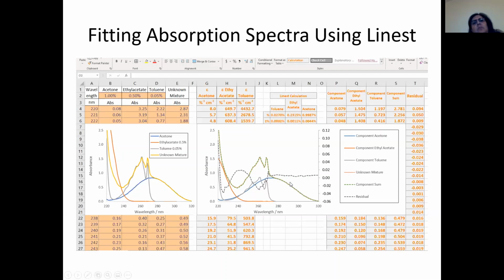If we subtract these values here, we come up with this dashed line here, which is plotted on the right y-axis, because the numbers are very small. And you can see that it's slightly imperfect, but it's not bad at all in terms of determining wavelengths or in terms of determining these component quantities. So that is all we got for today.